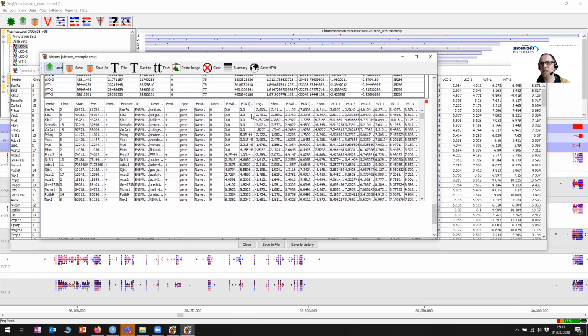But all of those annotations have gone in here. Okay, so it's a nice way of being able to annotate that up and putting it in here. Okay, let me just save this again. So I'm going to save this before I do anything else.